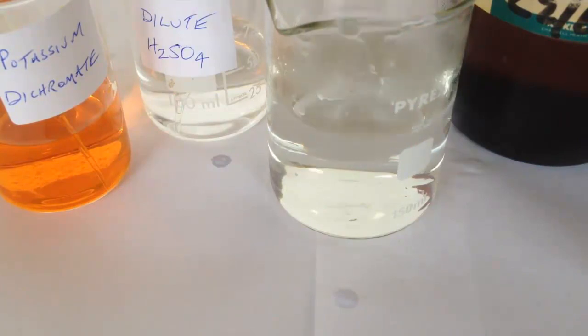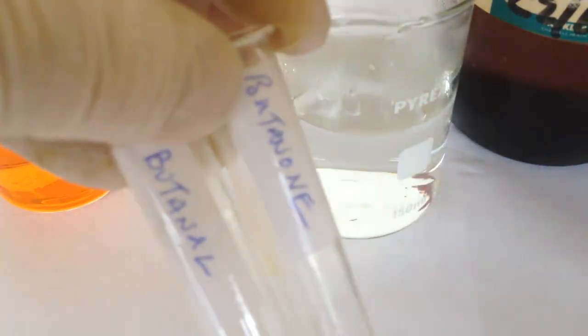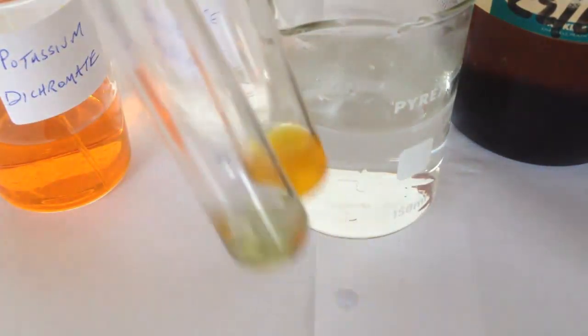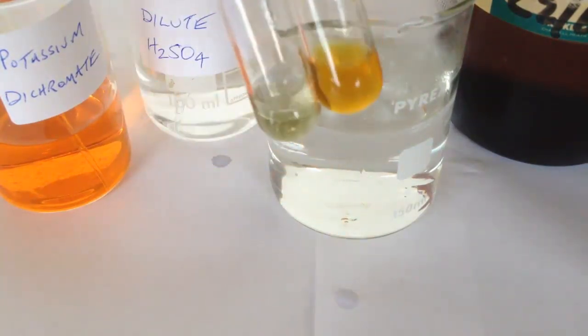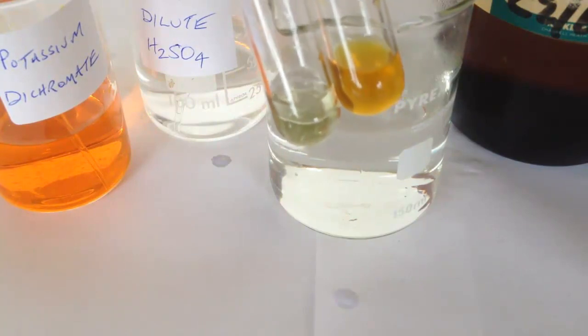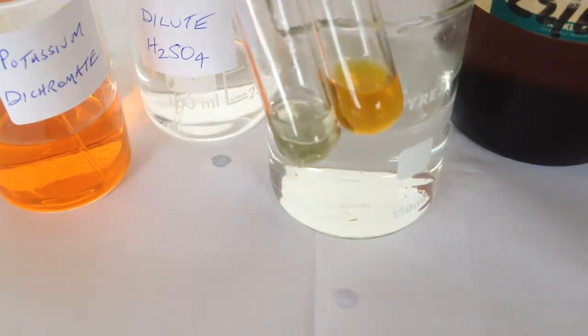On the left was the test tube containing the butanal. It's gone from orange to green, while the orange colour has persisted in the test tube on the right, which contained the ketone butanone.